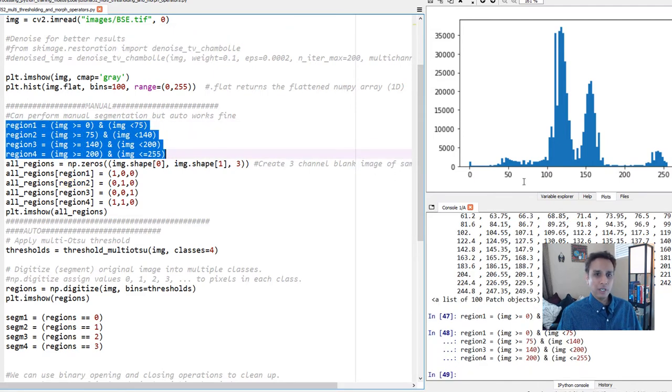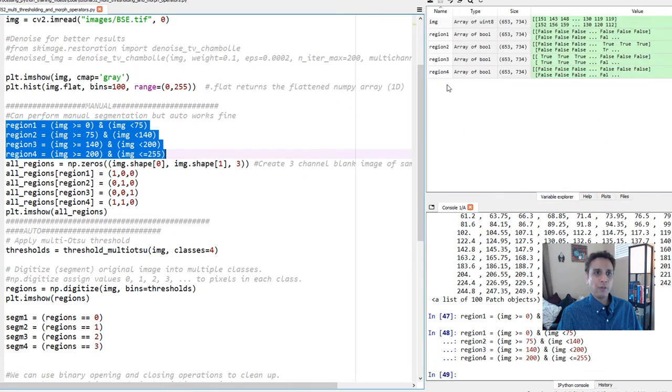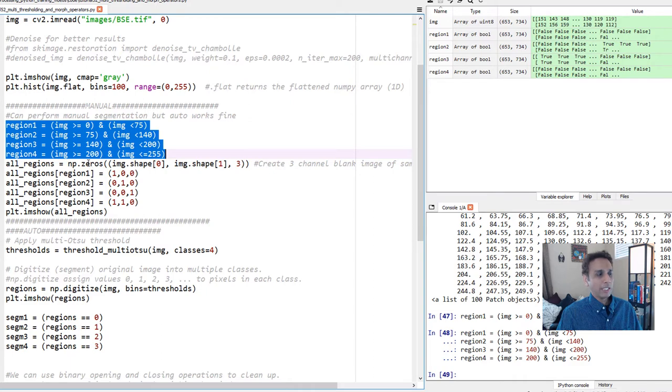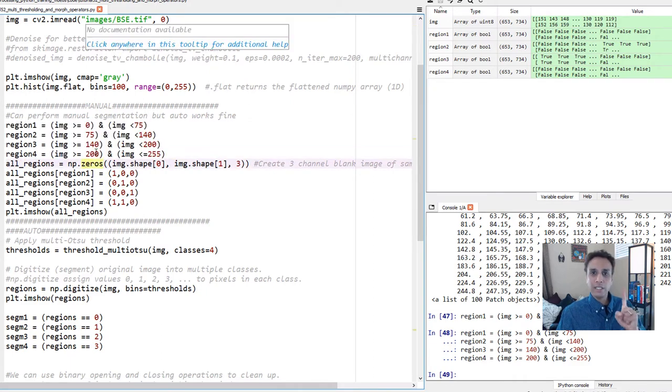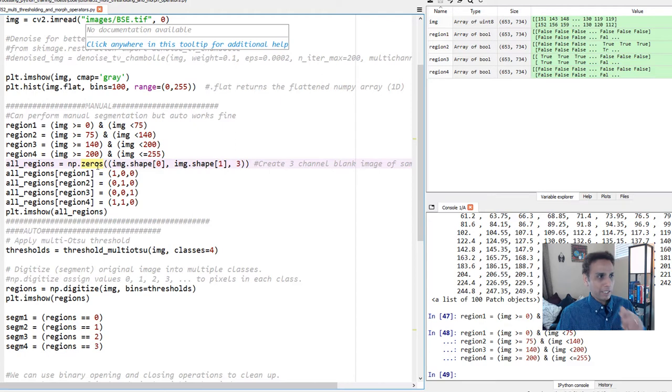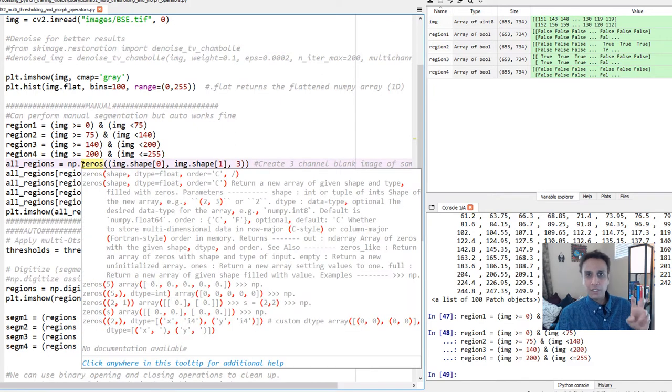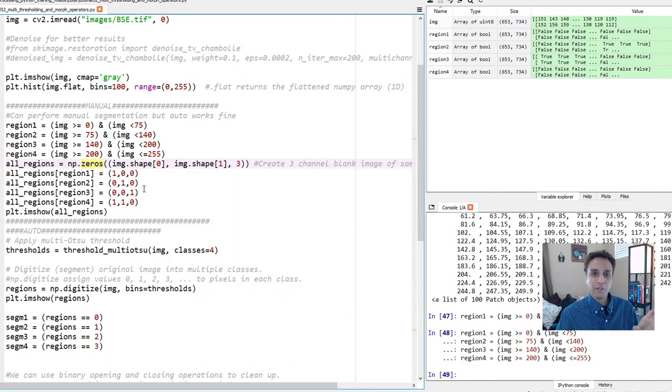I'm basically manually dividing this. So let's run these lines. Now we should see all of our four different regions - one, two, three, four - and they're all boolean arrays. Now what I'm trying to do is put all of these together into one single array. This is nothing but array manipulations. You'll get much better at NumPy array if you do these type of exercises, believe me.